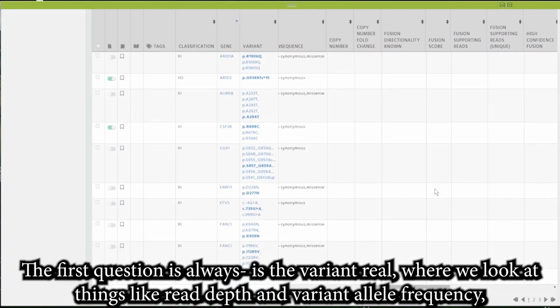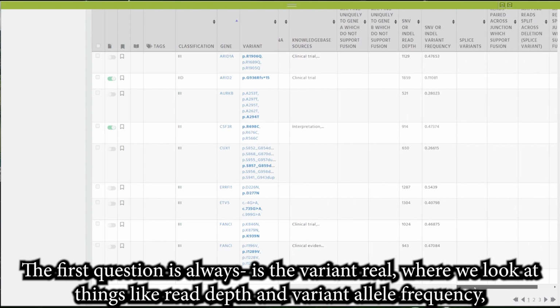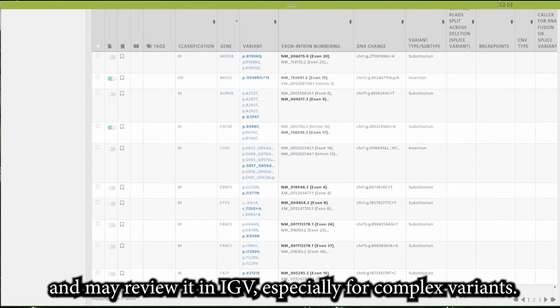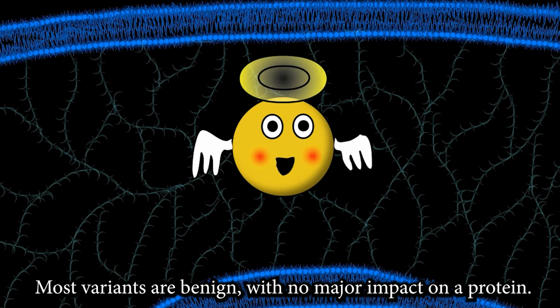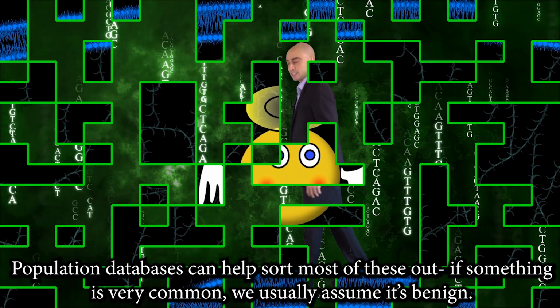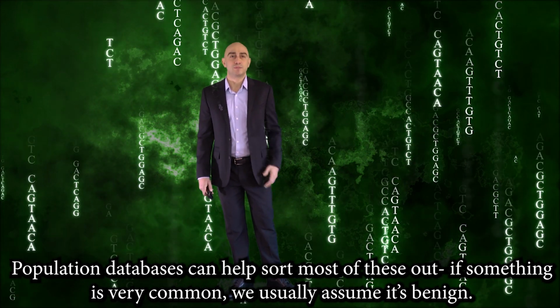The first question is always, is the variant real? We look at things like read depth and variant allele frequency, and may review it in IGV, especially for complex variants. The second question is, does it matter? Most variants are benign, with no major impact on the protein. Population databases can help sort most of these out. If something's very common, we usually assume it's benign.